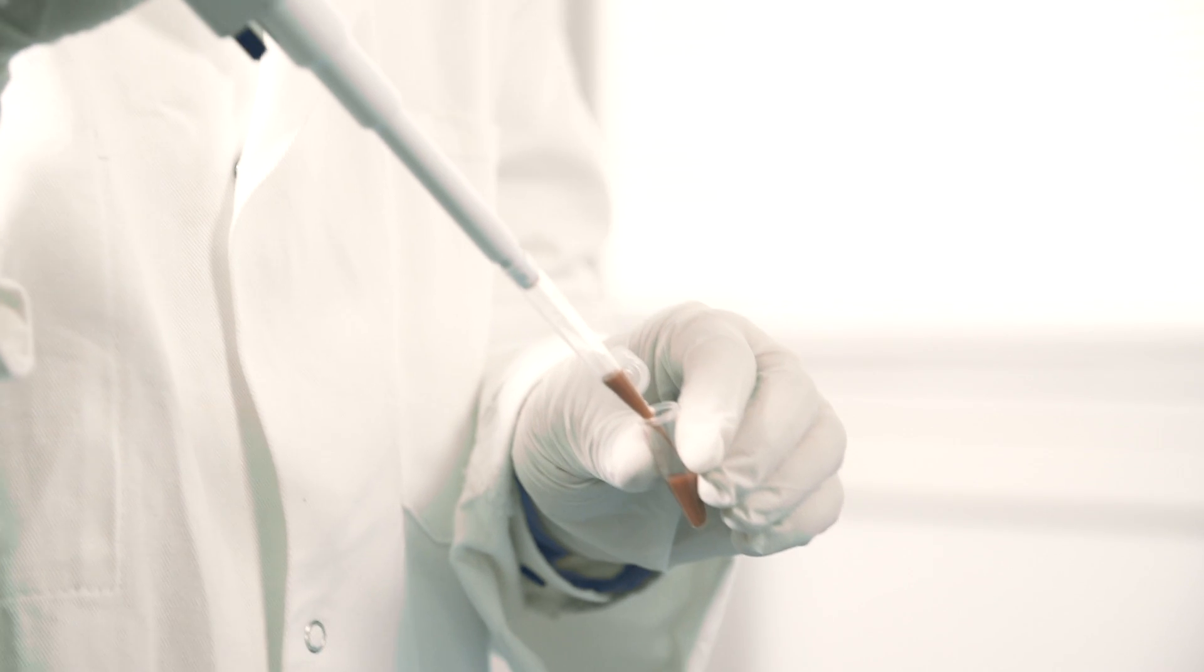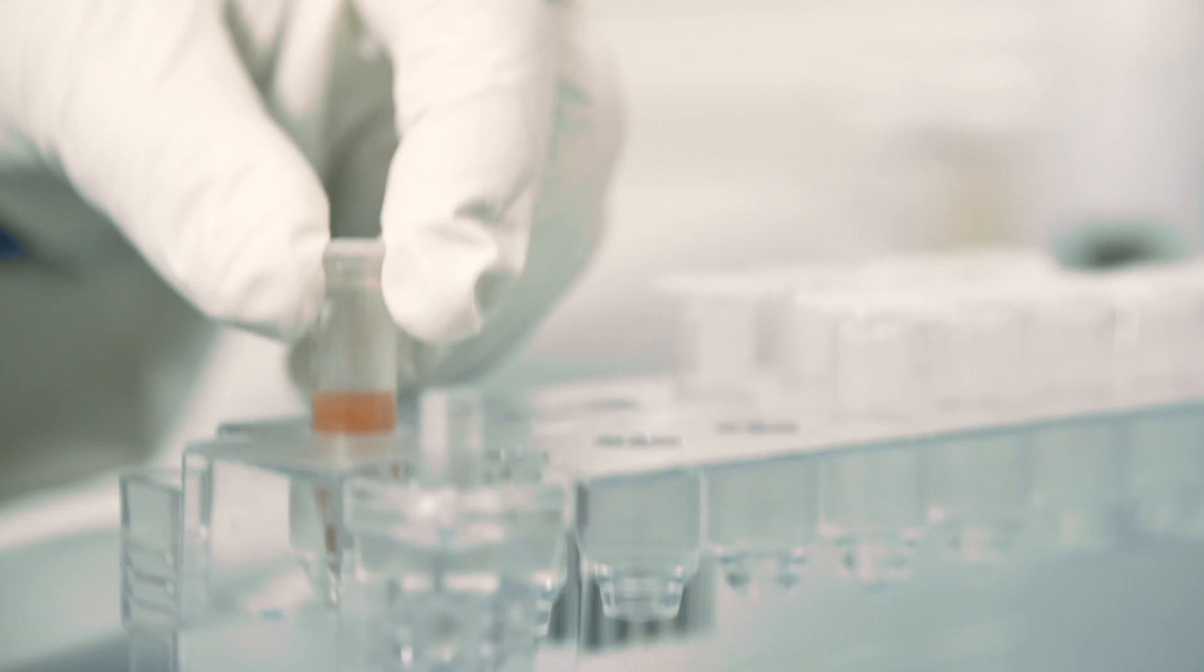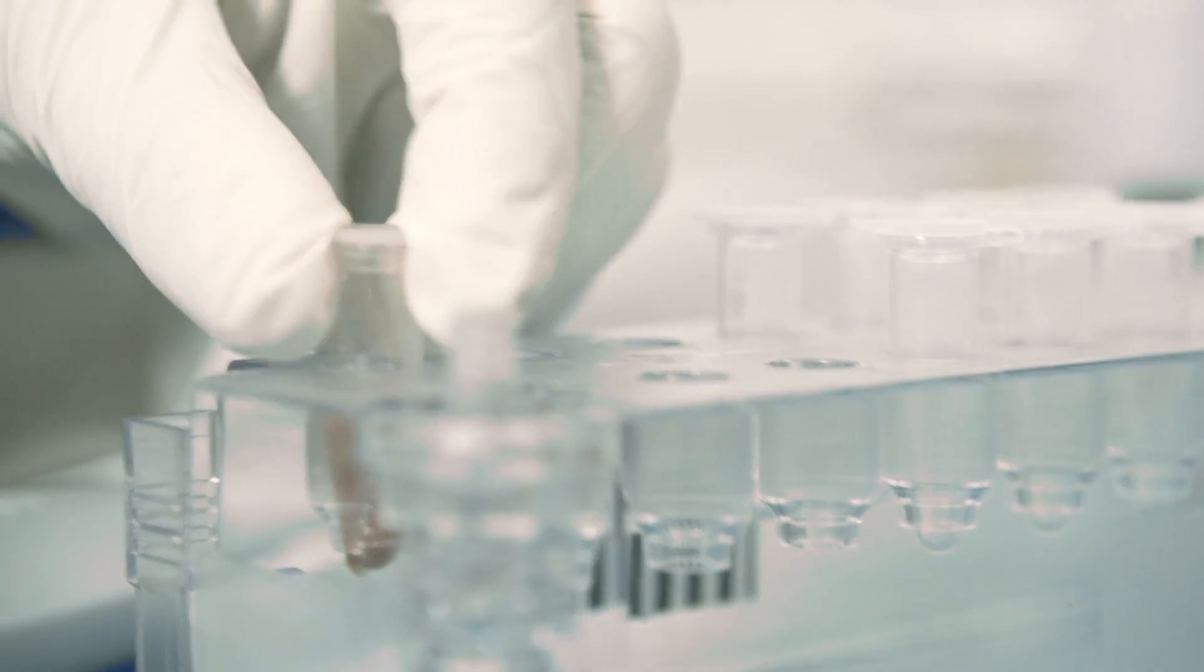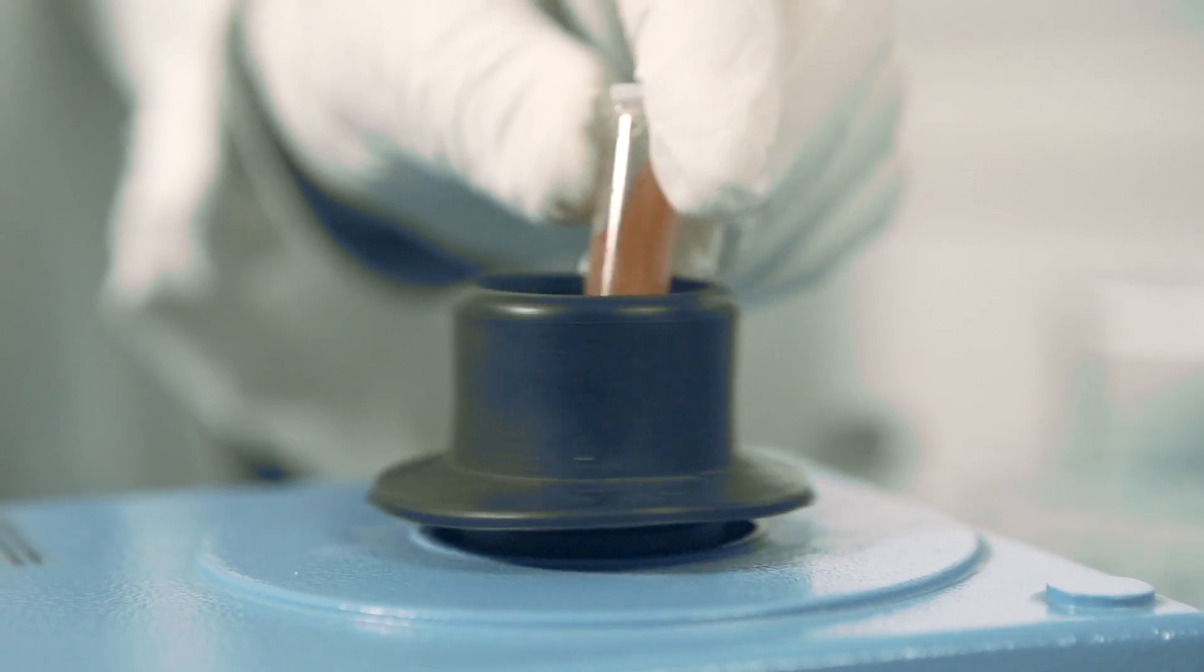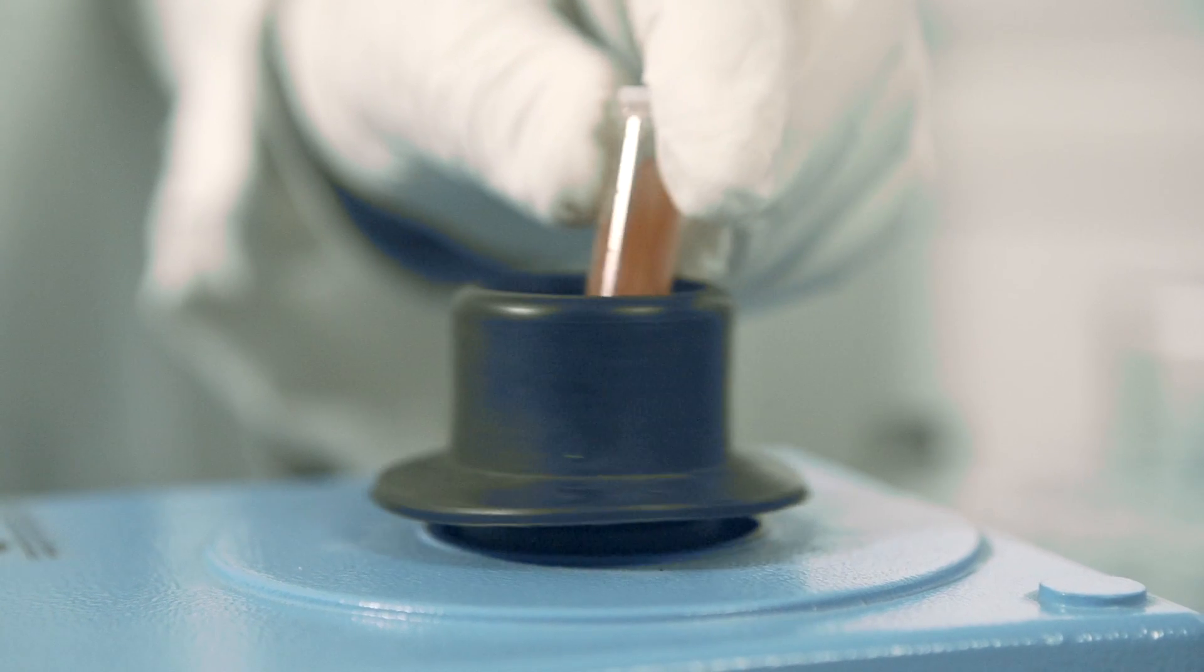Innovations in nanotechnology have empowered scientists to deepen their understanding of physical, chemical, and biological mechanisms.